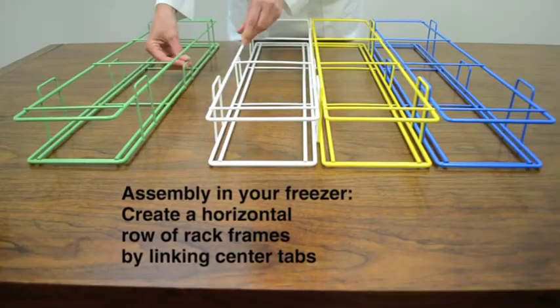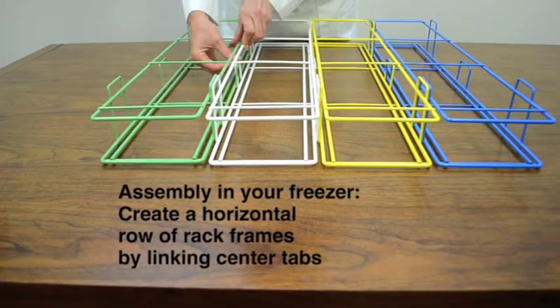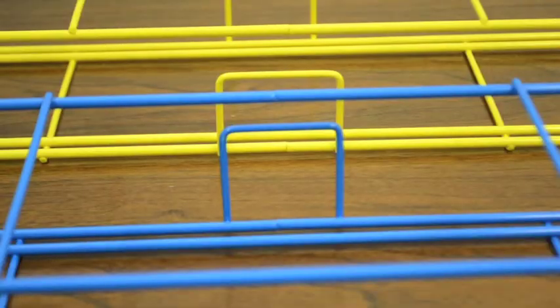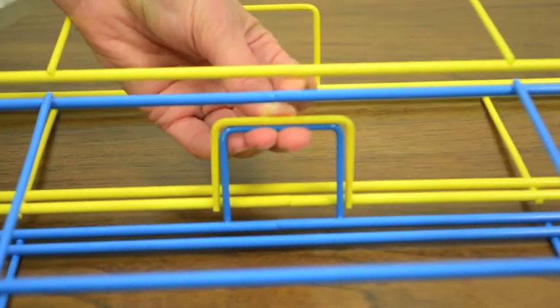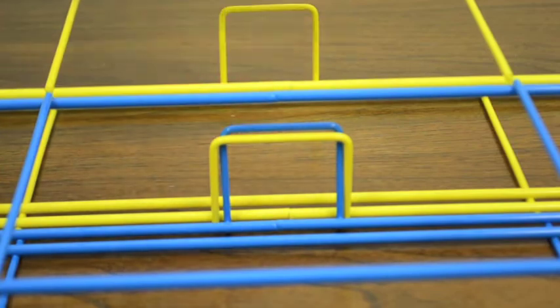To create a horizontal row of racks, position rack frames side by side and lift the wide center tab of one over the narrow center tab of the other to lock together.